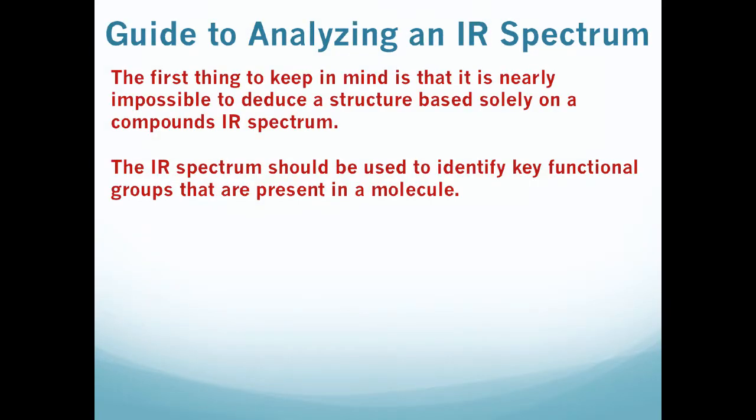In this final section, we're just going to go through some examples and pull a lot of information out of different structures so we can see how you might match a structure to a spectrum, and some examples where IR could be pretty useful in distinguishing different compounds.